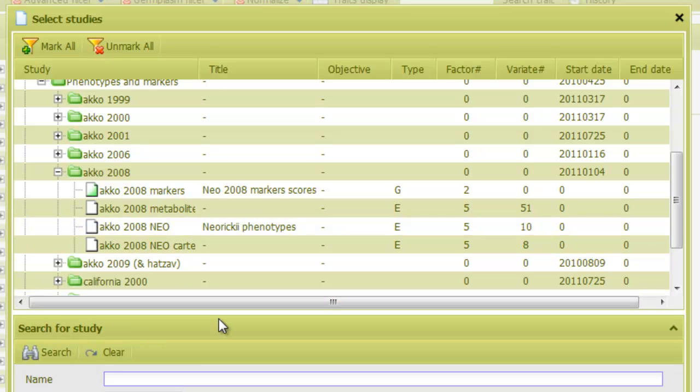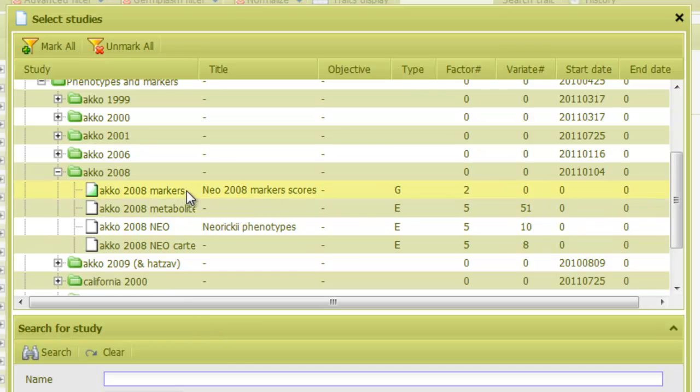Here we have both phenotype studies, where traits were measured on the population, as well as genotype studies, where markers were scored on it. For performing a QTL analysis, I have to select at least one genotype study and one phenotype study. Let's select these ones.